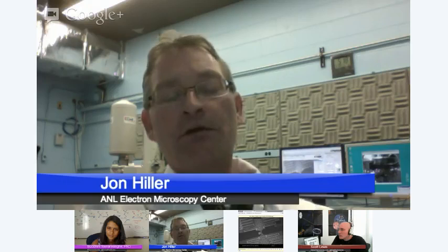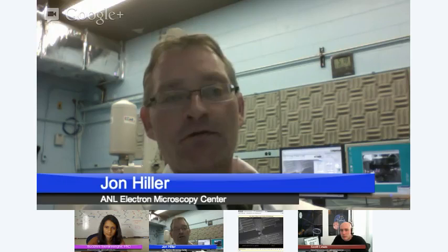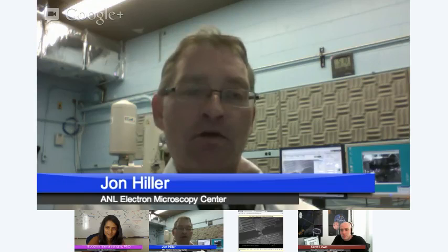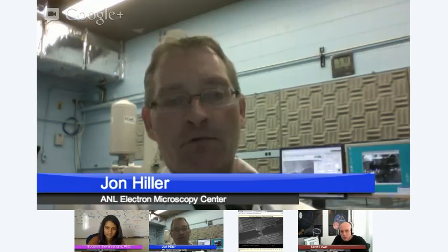When we go through materials characterization, the first thing you want to do is look at it with your eye. What does it look like? And then you take it to an optical microscope, and you get some optical micrographs of what it looks like. If you can't answer your question with a simple thing like that, then you take it to the next level, which is electron microscopy. We start off very simply, and what I'm going to talk about today is scanning electron microscopy, which is a lot easier for preparing the samples.